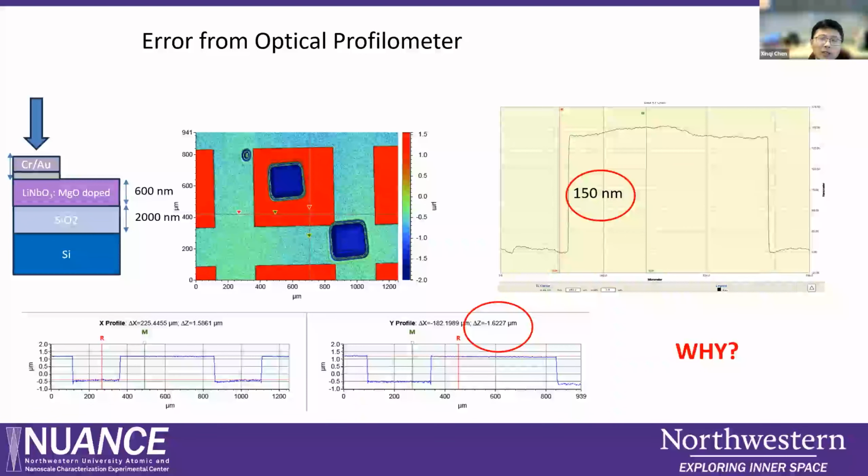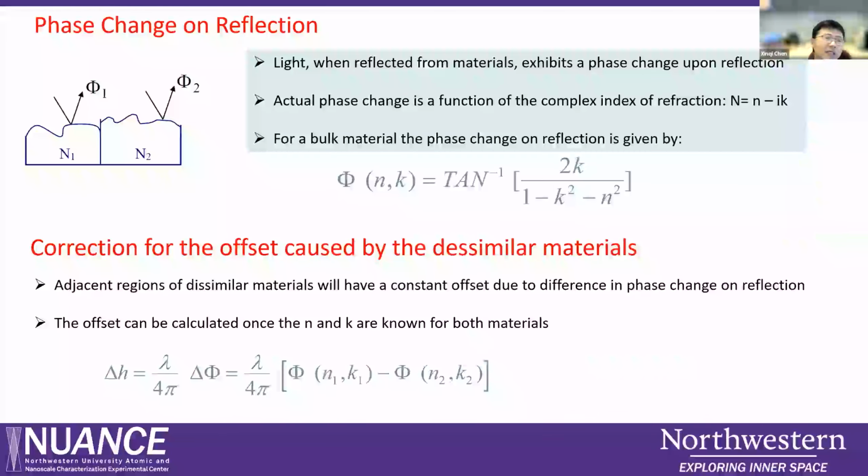So why do I trust this stylus profilometer, not just by common sense? The stylus profilometer is a direct measurement using a tip. Sometimes it gives you some error if your surface is rough, but because it is a direct measurement, it cannot generate a huge error. So the stylus profilometer result is always reliable. On the left here, they give the big reference. Why is this generated? On the next slide, I will show you this.